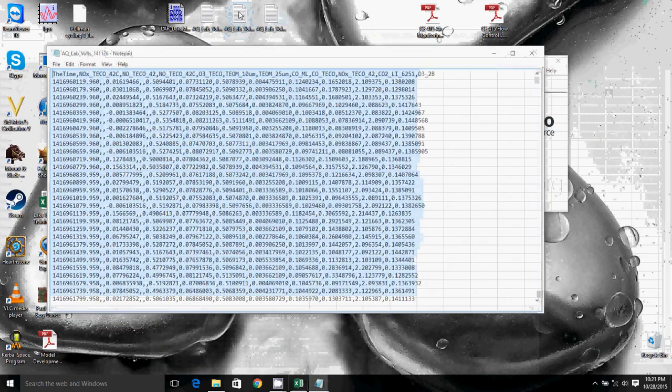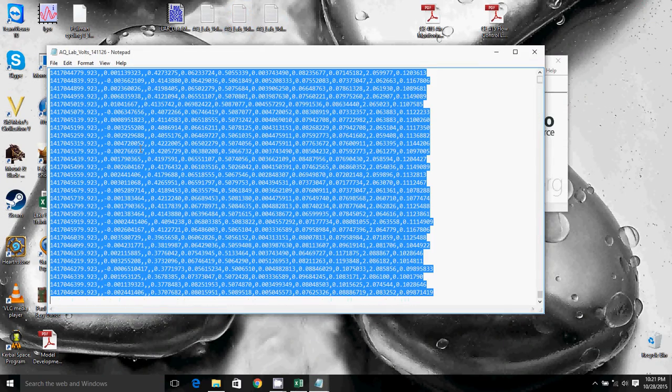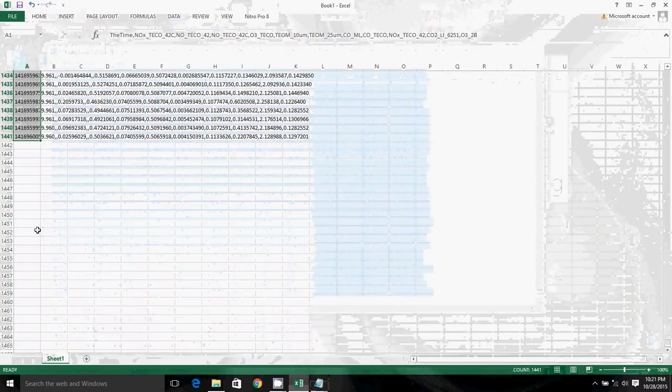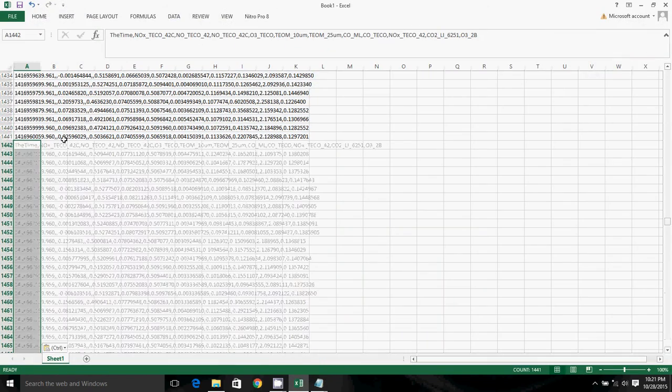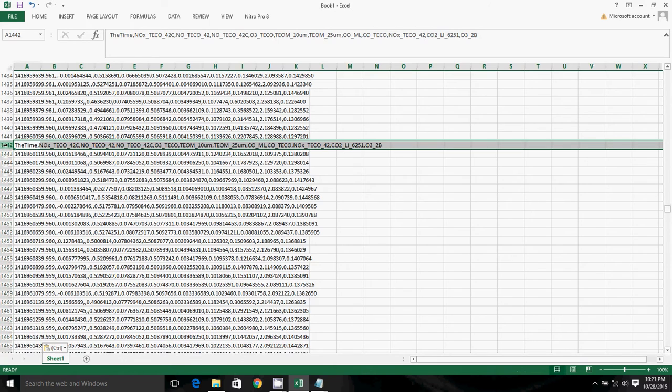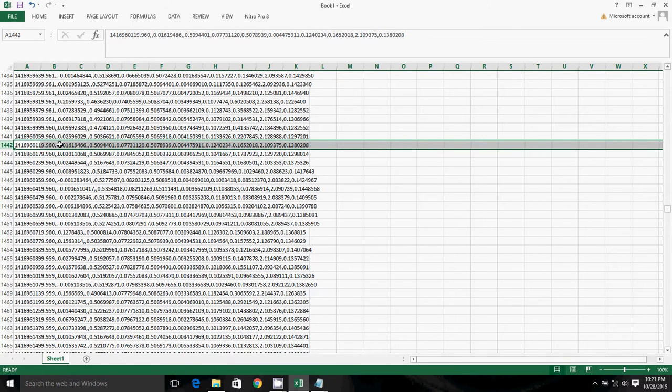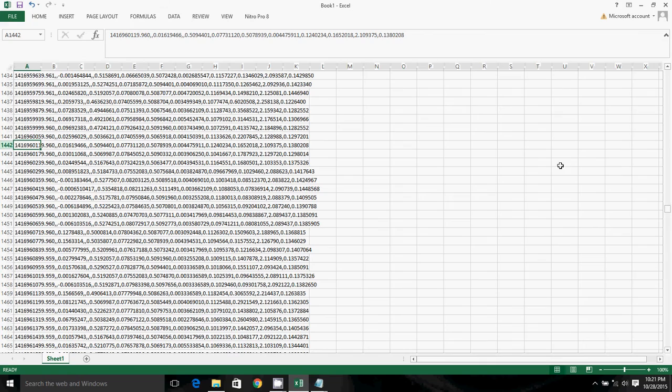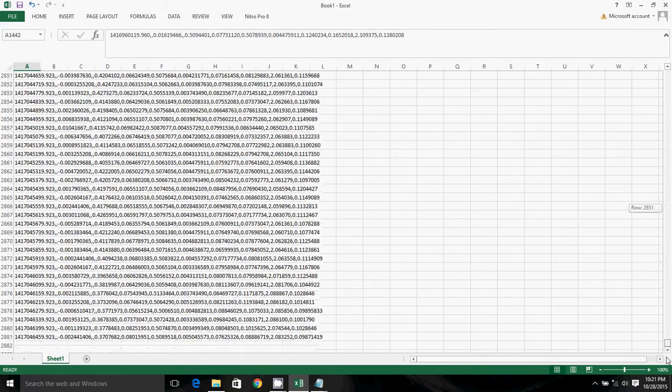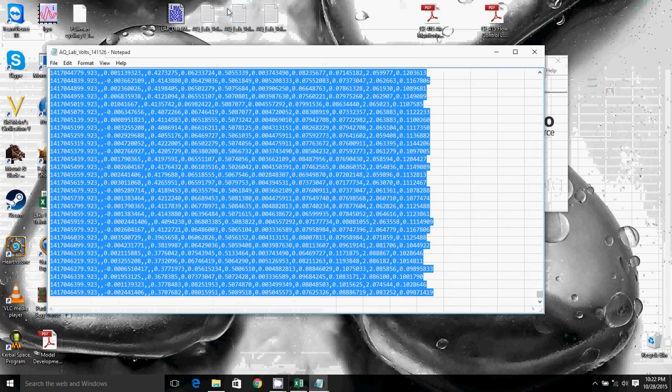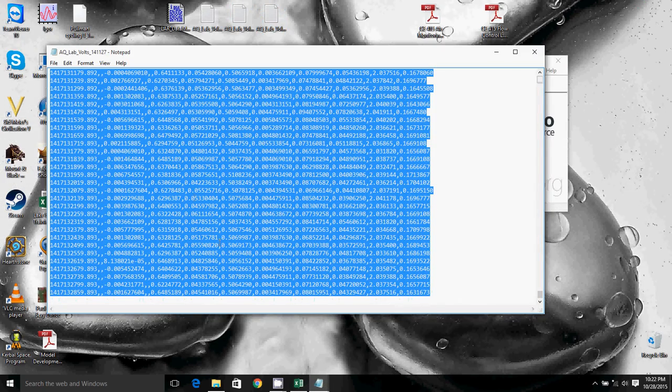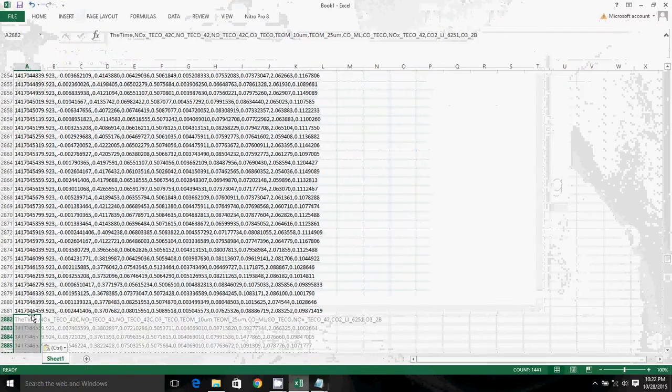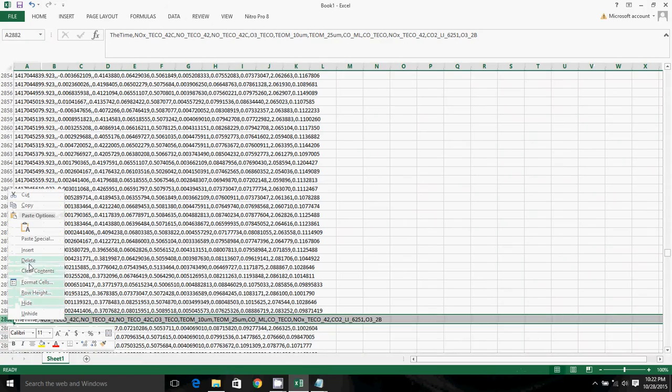So then we'll scroll down to the bottom, open up our second data file, again hit Control A to select all, Control C to copy, and then click below, hit Control V to paste. I'll then right click and then click delete on that header row because we want to delete all of the text. Because we have text values in the middle of a data wave, Igor is not going to be happy with that. And then we'll go ahead and load our last file into Excel. I will again delete this row.